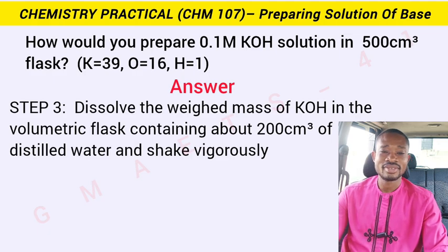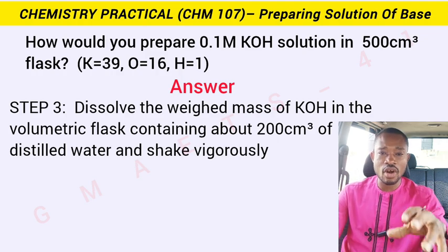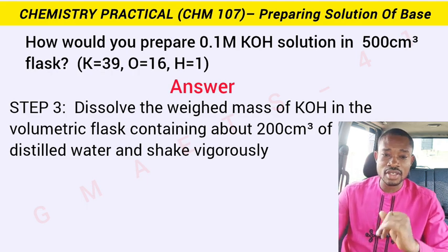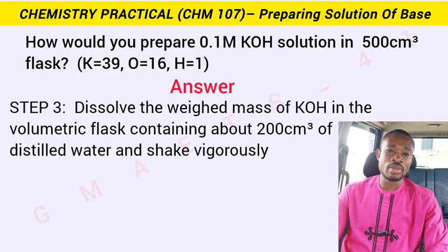Of course, the distilled water is going to be contained in that 500 cubic centimeter volumetric flask.